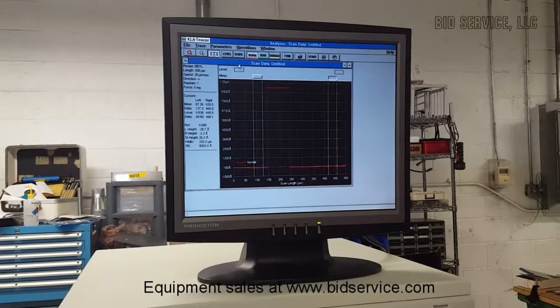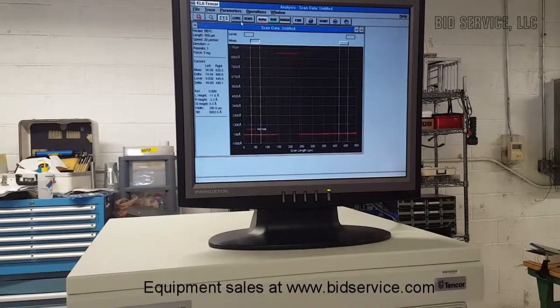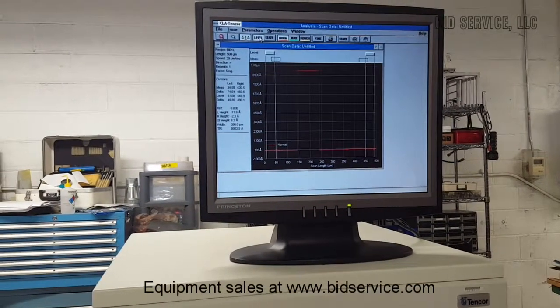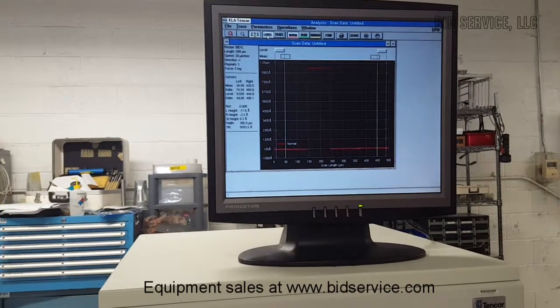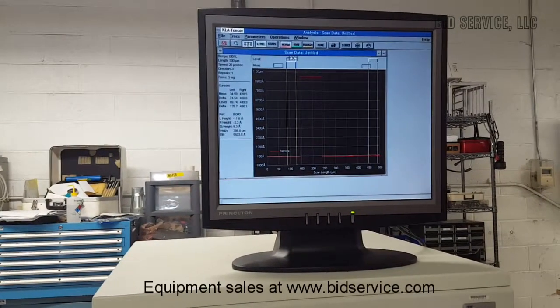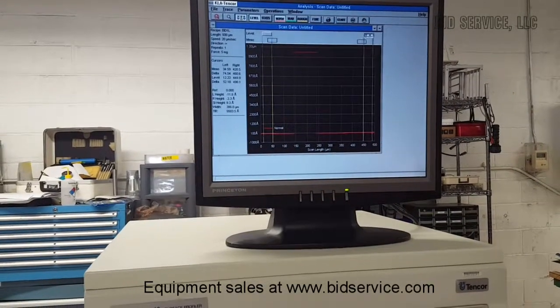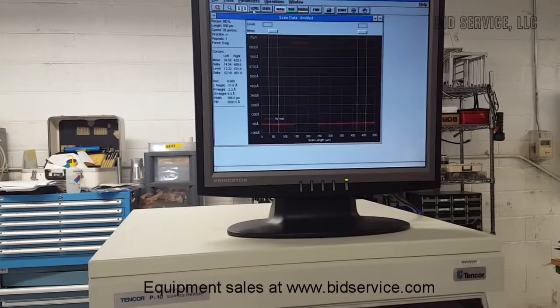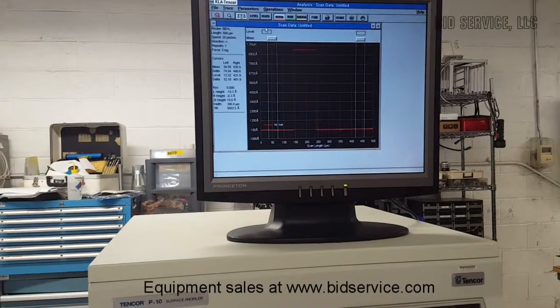Sometimes the profile is not leveled because of sample variations or a slight tilt in the stage, so you click on level. When you select level, the level cursors can be moved. You have to move the level cursors to the same level zone, and then you click level again. At that stage, the profile will be leveled with respect to the leveling cursors.